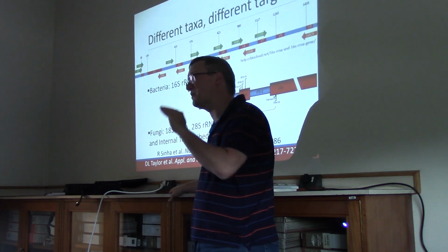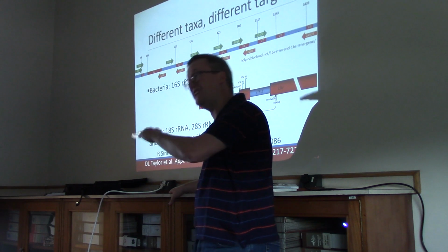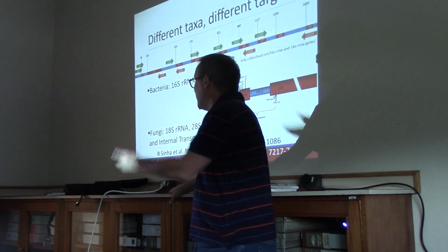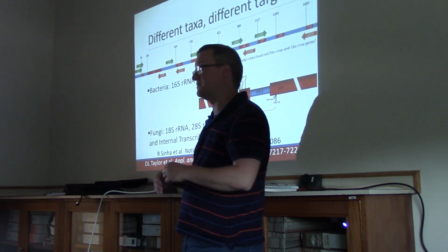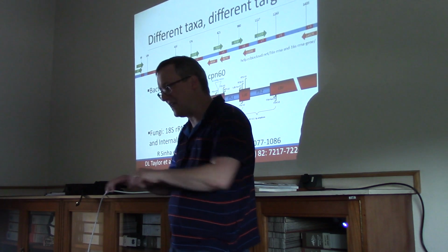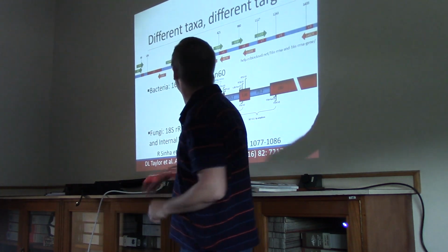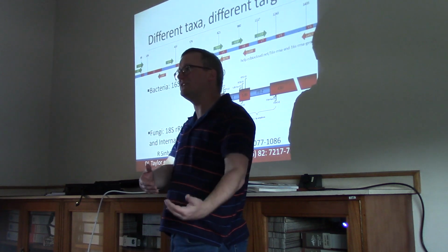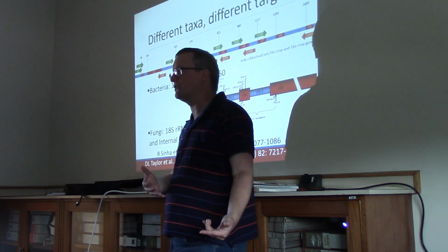But we can't put a primer in that space because it's so variable. To make a primer that matches to that variable region will give us the ability to resolve things that have the parts that aren't on the primer, but that very primer will not be applicable to species that have a different sequence at that location.